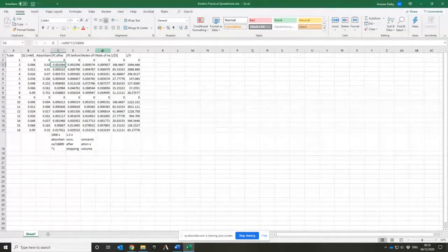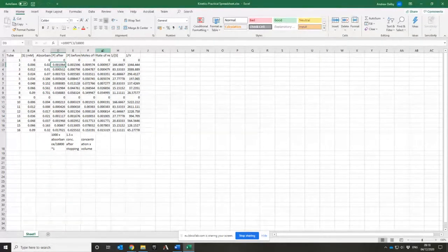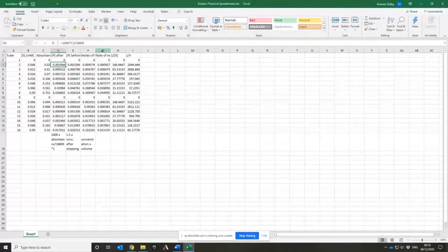So what you've got there is you've got 7 data points. Now I can fit a curve to it, which includes 8 or 9 or 10 different values of x to end up fitting a curve. But then my curve is more complicated than the set of data I originally had. So this is a process called overfitting.